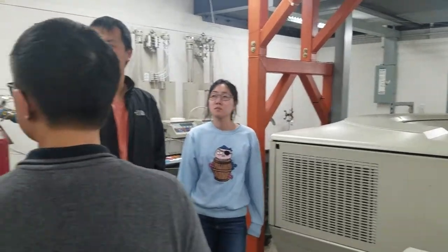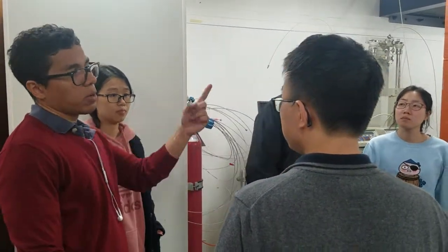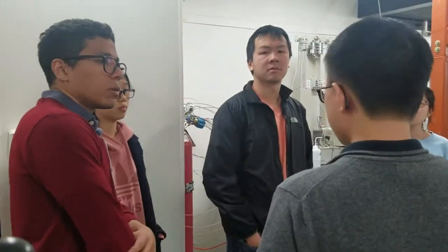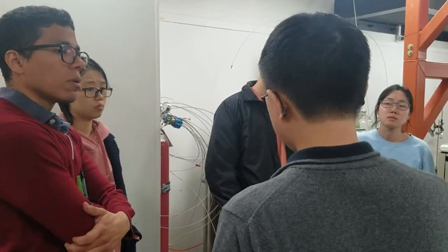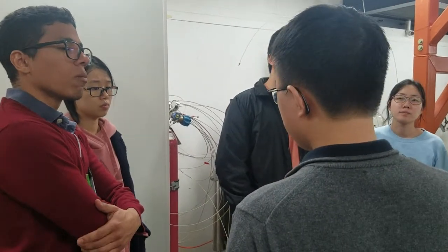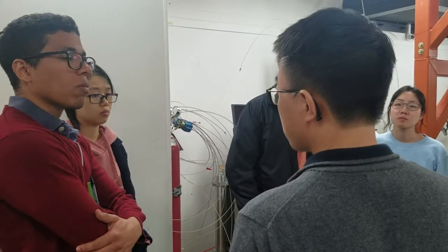Is this machine capable of obtaining the same resolution as the other one, and at the same time having real-time experiments? So as I just said, the resolution for this one is coarser. Imagine you have 200 micron times 200 micron times 1 centimeter. Then you have thousands of grains inside.